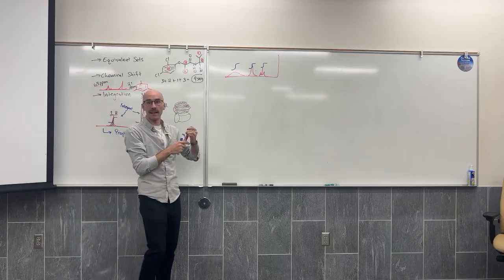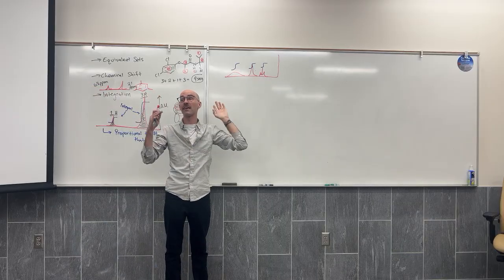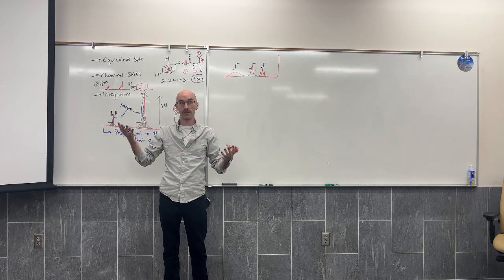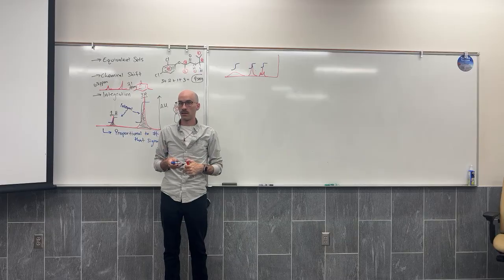But that's what I'm trying to get at: it's not the shape, it's not the height, it's not the width, it's all of that combined. So when multiple parts are changing, you don't know exactly what impact it's going to have.